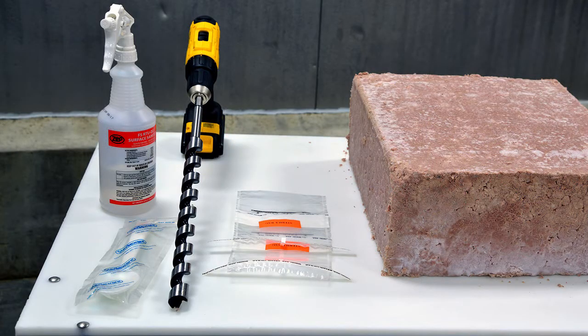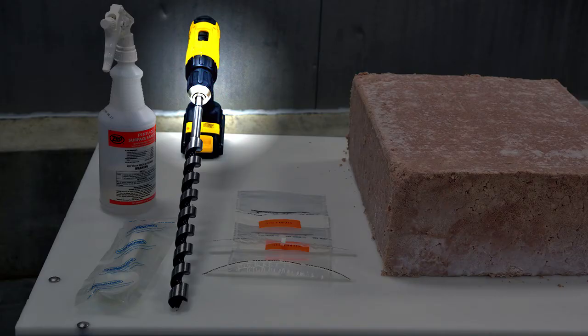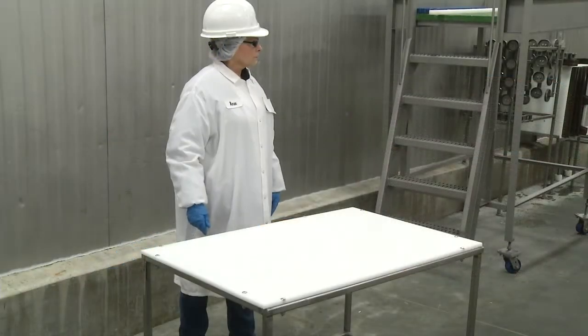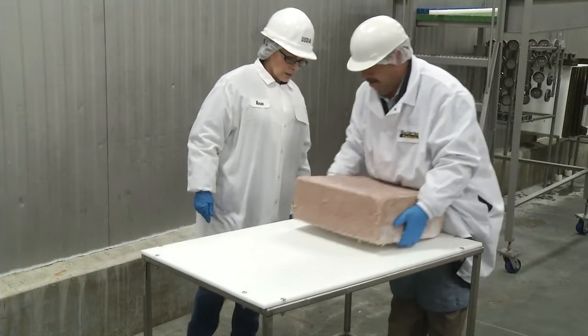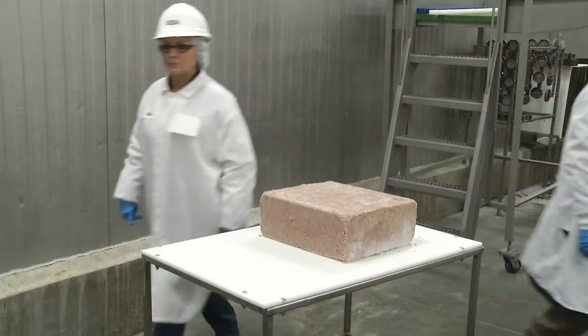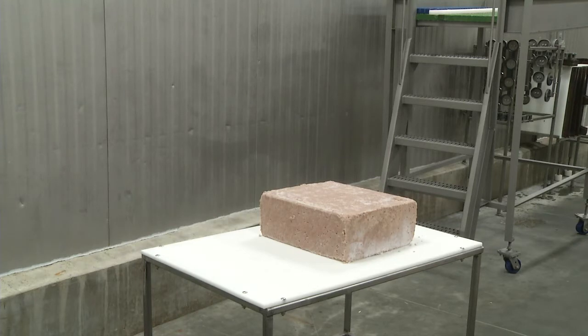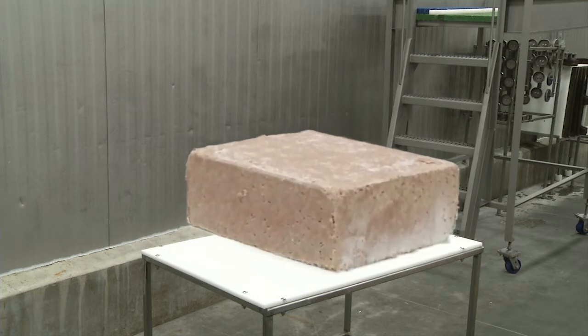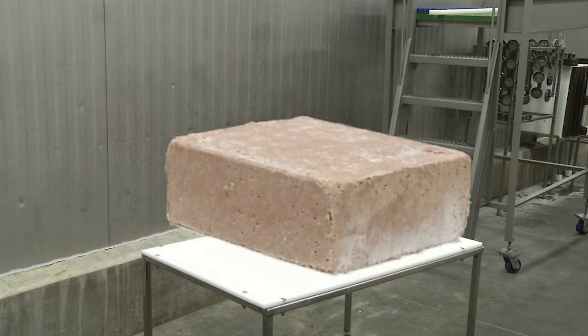The main difference between other sampling methods and the drill sampling method is the use of a drill, a drill bit, and a spoon to collect the samples. This method is best used on frozen, non-intact product so as to maximize the amount of product shavings in the sample and minimize the amount of ice. In addition, it's best used on reasonably homogeneous product so as to avoid having a disproportionate sampling of only part of a product, such as too much skin or bone.